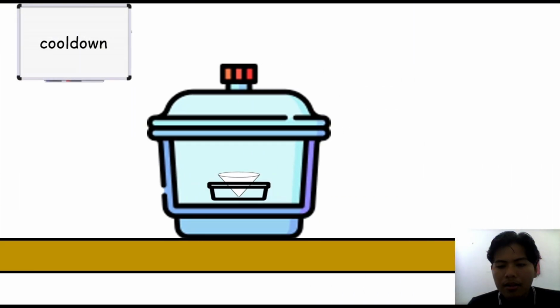And then after the heating, the filter paper is allowed to cool down inside a desiccator.